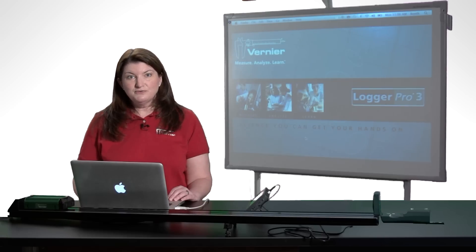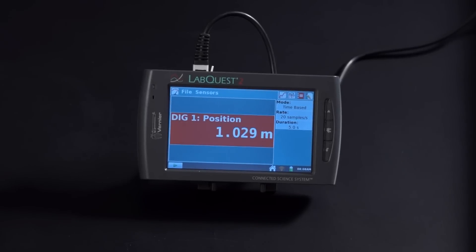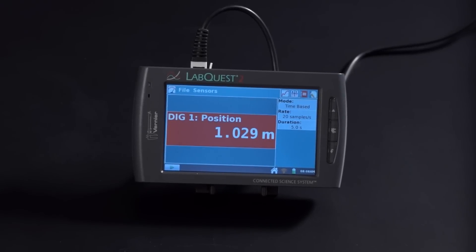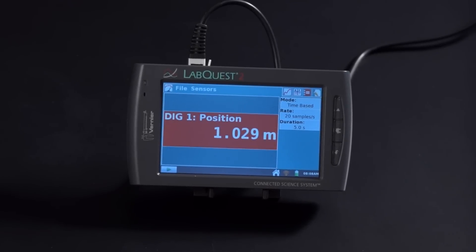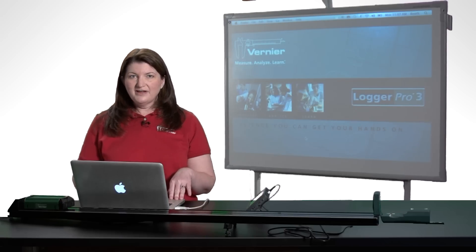You can also use the Viewer to make screenshots for lab instructions. To connect your LabQuest to your computer, with a LabQuest 2 you can connect it with a USB cable or through wireless connectivity. If you have an original LabQuest, you have to do it by Wi-Fi and you'll need a USB Wi-Fi dongle to do that.